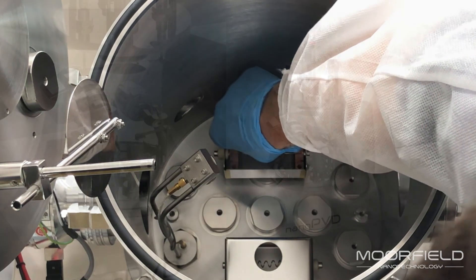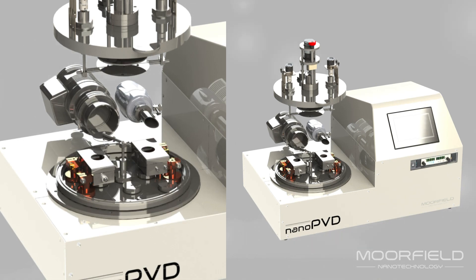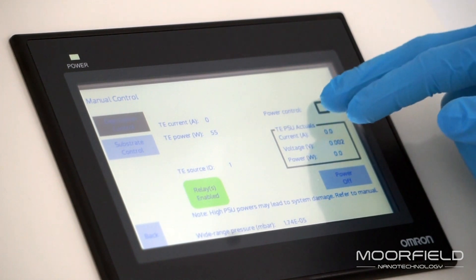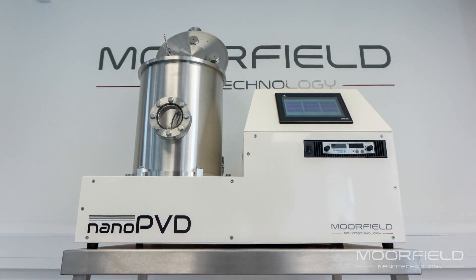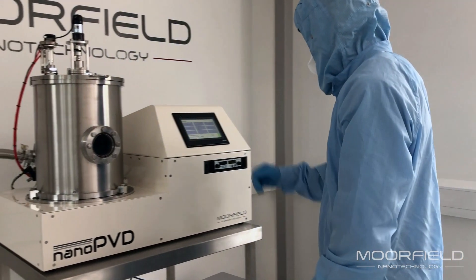Each unit can hold up to four sources if required, and these can be different types. State-of-the-art power supplies allow for deposition with controlled power or temperature as appropriate. The nano PVD T15A has a tall chamber ideal for high uniformity coating and for lift-off applications.